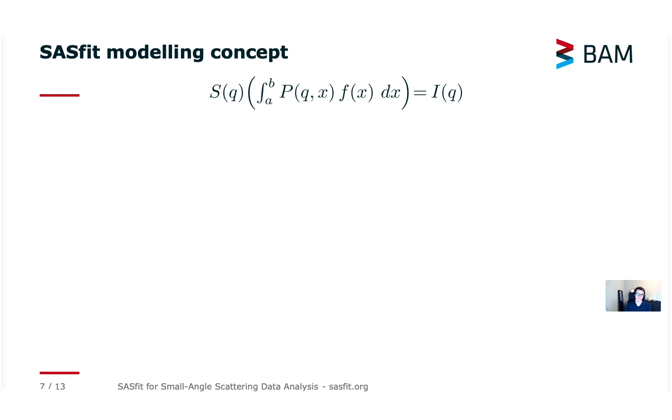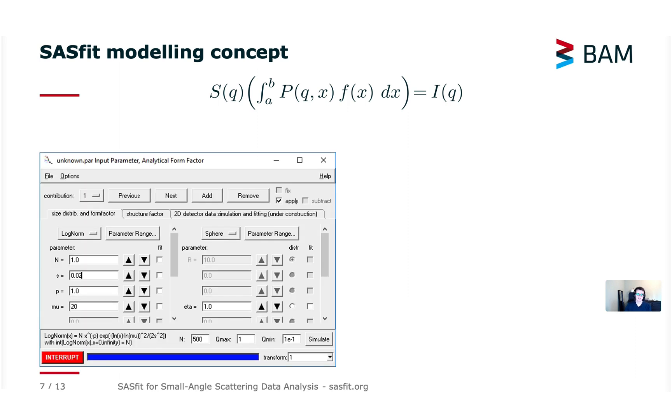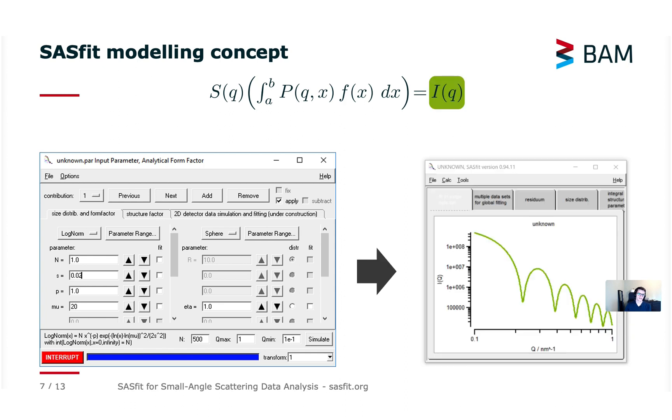Let me give a short overview of the general modeling concept. Here you see a window of the SASFIT program where you can configure your model setup. It's a simple case for only a single model to fit to a scattering curve. So in this area you set your parameters and when you press simulate for example the calculated model intensity is shown in a different window or can be fitted to the loaded data as shown here on the right.